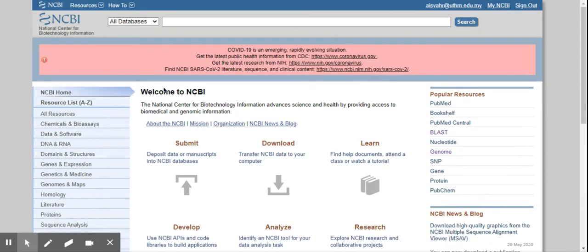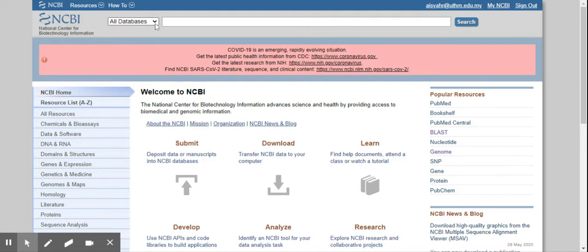So you have the front page of the NCBI. So here is all databases and you can choose different types of things that you want to see.